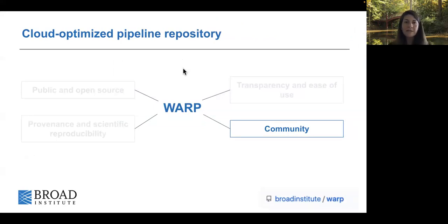Can we tell the major, minor, patch update based on the version number? Yes, so the version number, like v2.3.4: the 2 is the major number, the 3 is the minor, and the patch is the 4. If you see a pipeline go from version 2.3.4 to version 3.0.0, you know that a major change has happened because we've changed that major number. That tells you right away that you're going to need to reanalyze data if you've previously analyzed with an earlier version of the pipeline.